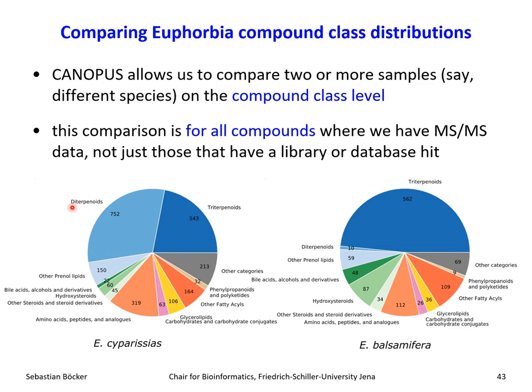Also noticed, I already mentioned that we don't always have to go very deep into the classifier hierarchy. These higher classes sometimes contain the more interesting information, because if we go deeper and deeper, in the end, there will be one or two compounds in every compound class. That's not even very helpful. And most compound classes actually don't contain a single compound.